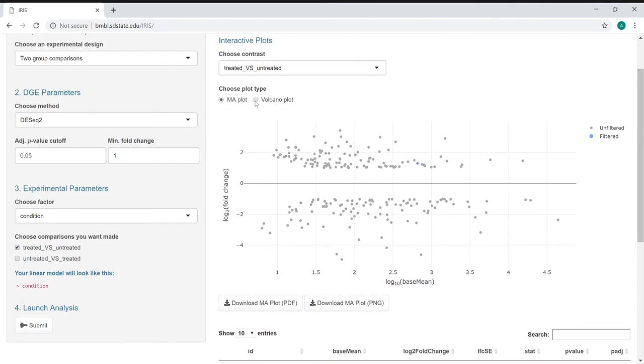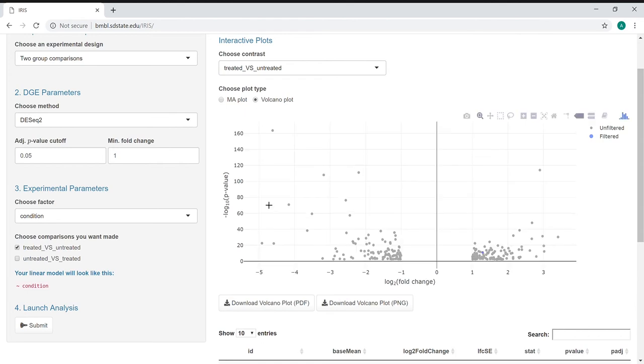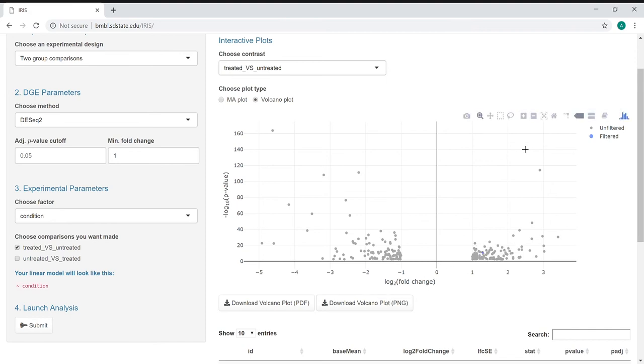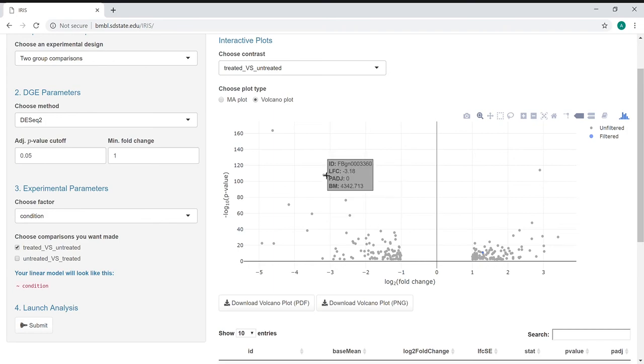You can also look at a volcano plot, which shows different information. It also involves the fold change, but it then looks at the log p-value. It's called a volcano plot because we get this exploding look towards the outsides. If you look at the full figure, you'll see that a lot more clearly. What you see is also that same interactivity and the same selectivity.